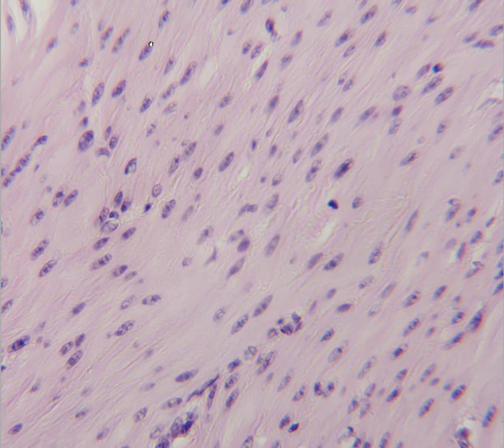Now, one of the things that people sometimes have difficulty with, and I'll give you a little heads up on it now, is some people will mix this up with dense fibrous connective tissue, simply because the nuclei somewhat resemble the cell nuclei of the fibroblasts in the dense fibrous regular connective tissue.